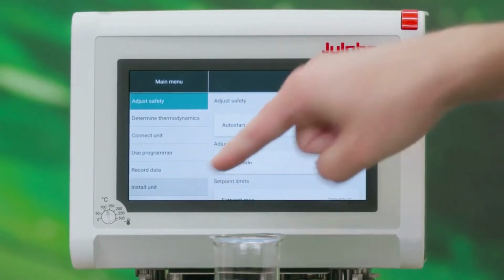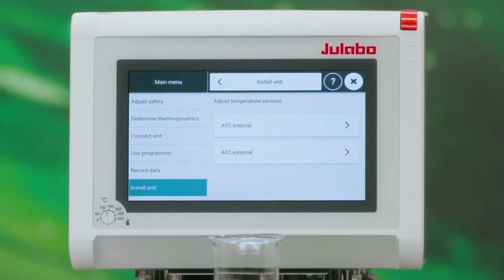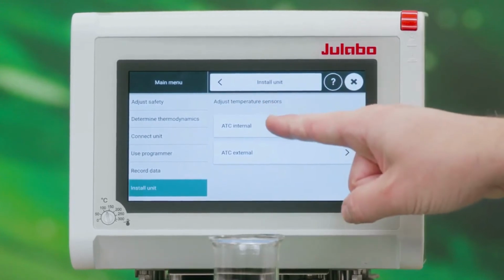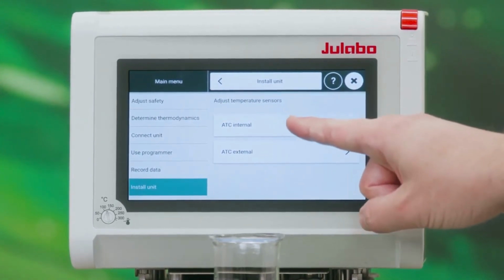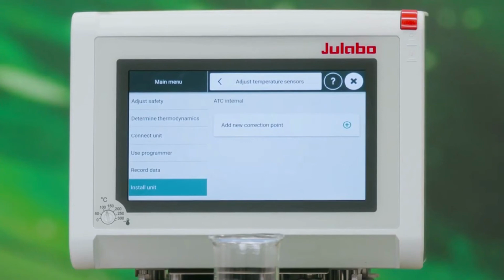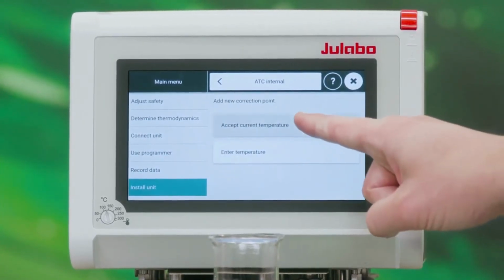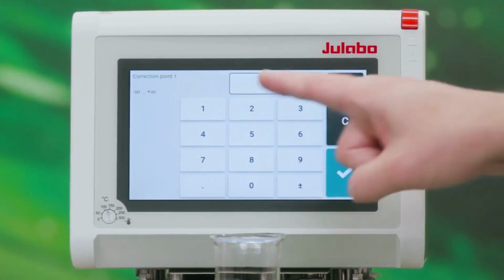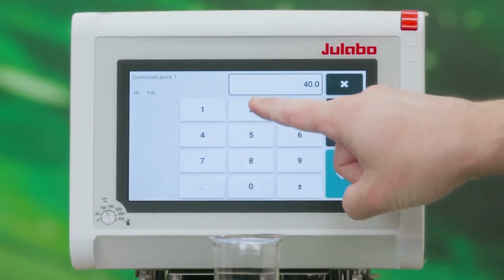In the submenu Install Unit, you will find the section Adjust Temperature Sensors. For adjusting the temperature inside the bath, choose ATC Internal. For adjusting the temperature in an external device, such as a reactor, choose ATC External. For our example, we choose ATC Internal and add a new correction point. With Accept Current Temperature, you can simply enter the temperature we measured before, 40.02 degrees Celsius.